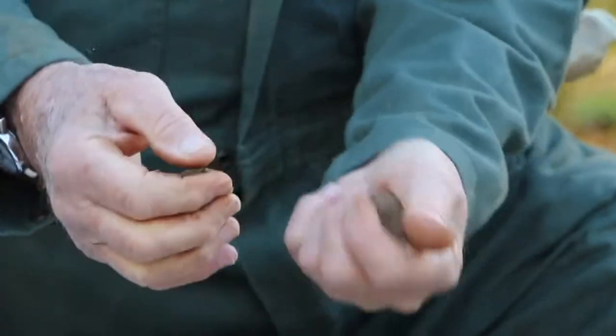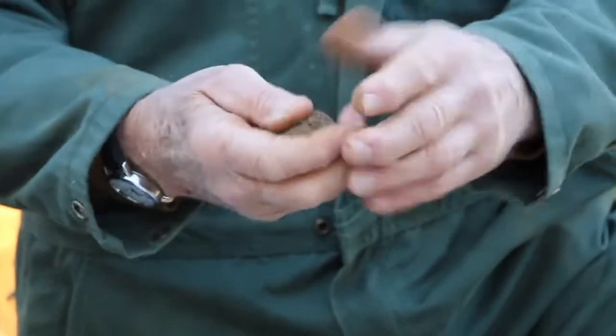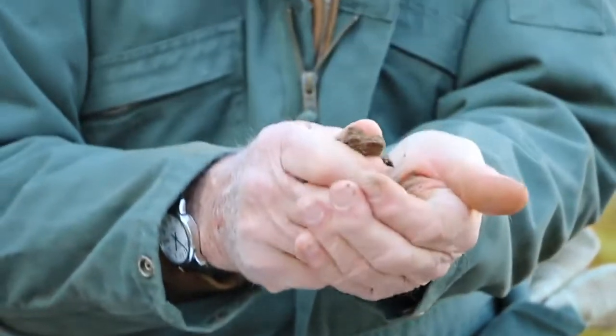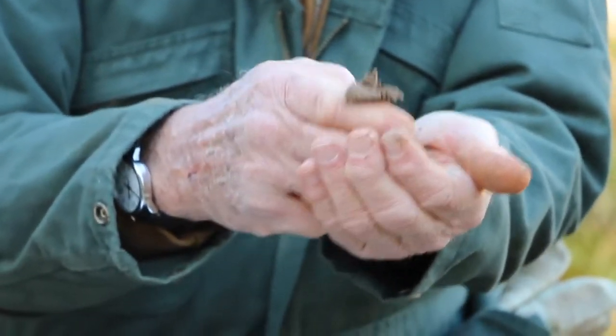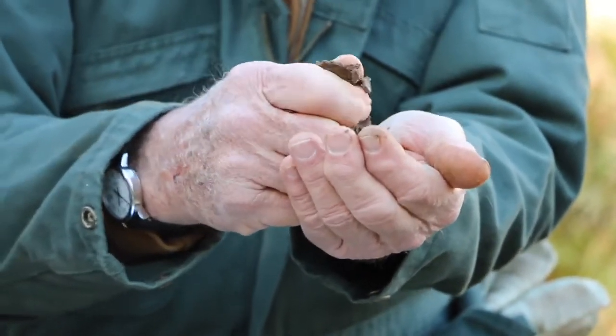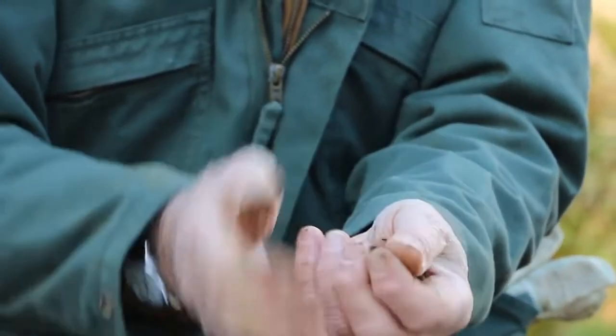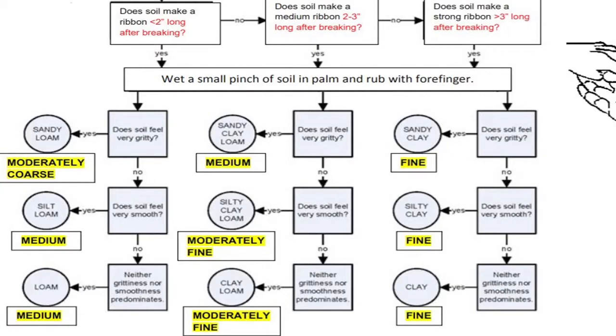This next sample should be a moderately coarse sample. It will form a relatively stable ball. When you attempt to make a ribbon, you're extruding the sample between your thumb and your finger upwards and letting it curl out over your finger. In this case we're getting about a half inch of ribbon, and if you look at the flow chart, a half inch to an inch ribbon puts you in the sandy loam category, or for envirothon, the moderately coarse zone.